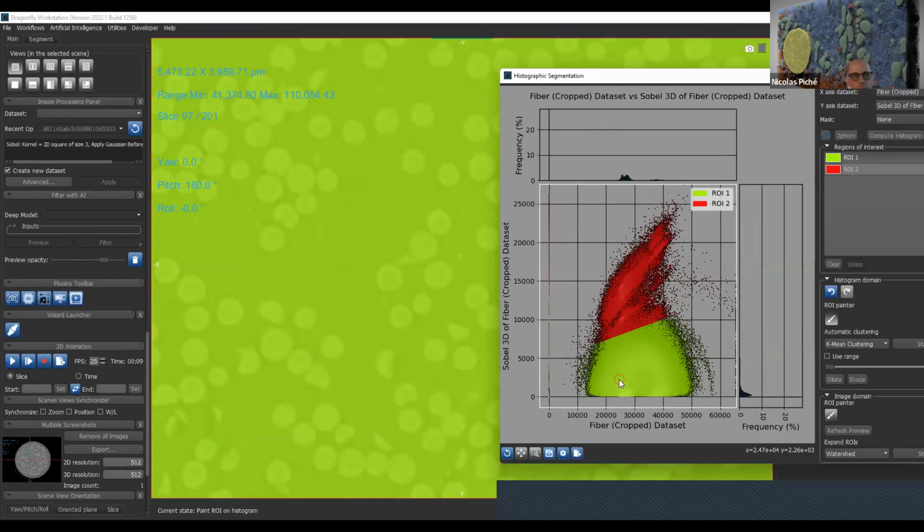So the question was automatic clustering, exactly what I'm showing, but in real life, in real space, with real data, and you're pushing the instrument always at the limit, well, it's not so useful. I find it not so good to generate segmentation, but more to understand the relation between data. You have 2 energies, you put them in the histogram, and this tells you something. You see clusters, it means something. If you see a straight line, it means there's no value for your multiple energies. So it's a good tool to introspect data, and visually click, where in my histogram is that feature?